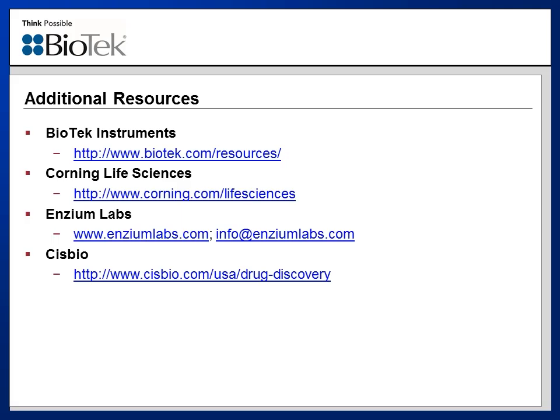Okay, the second is, do you have a list of cell lines responsive to CXCL12 in this assay other than MDA MB231? I do not.